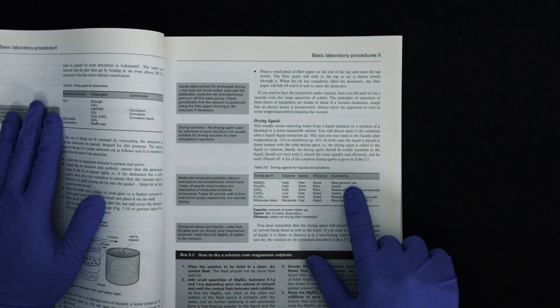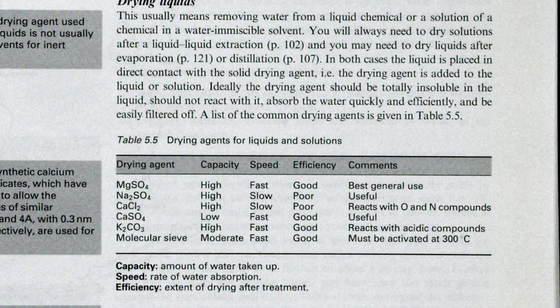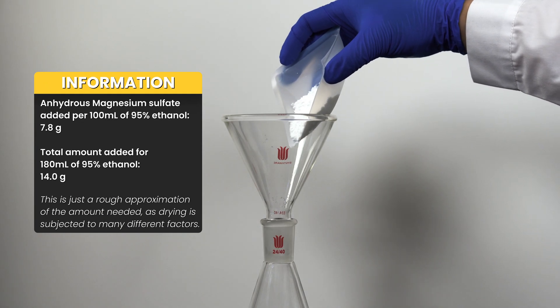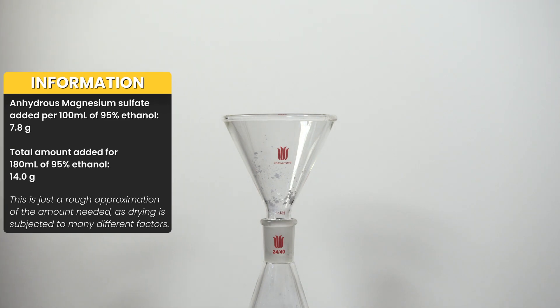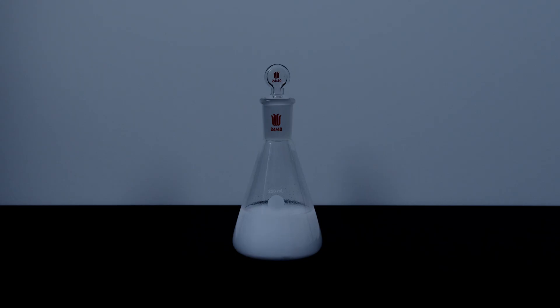While anhydrous magnesium sulfate is one of the most accessible drying agents, it is not the best overall. Anhydrous sodium sulfate and 3A molecular sieve can also be used — I've included a simplified pros and cons list on screen. In theory, anhydrous magnesium sulfate can take up to 7 moles of water per mole of salt, but full hydration takes time, so I assume only 50% efficiency. As such, we use around 7.8 grams of anhydrous magnesium sulfate per 100ml of 95% ethanol. 14 grams is added to a flask containing 180ml of 95% ethanol. The flask is stoppered and allowed to sit overnight — ideally 24 hours — with occasional swirling to let the desiccant fully absorb the water.